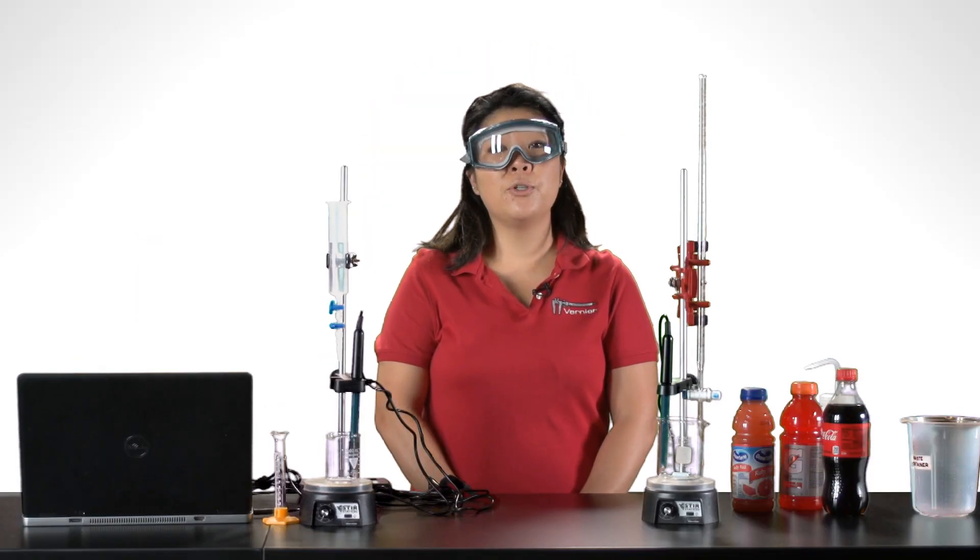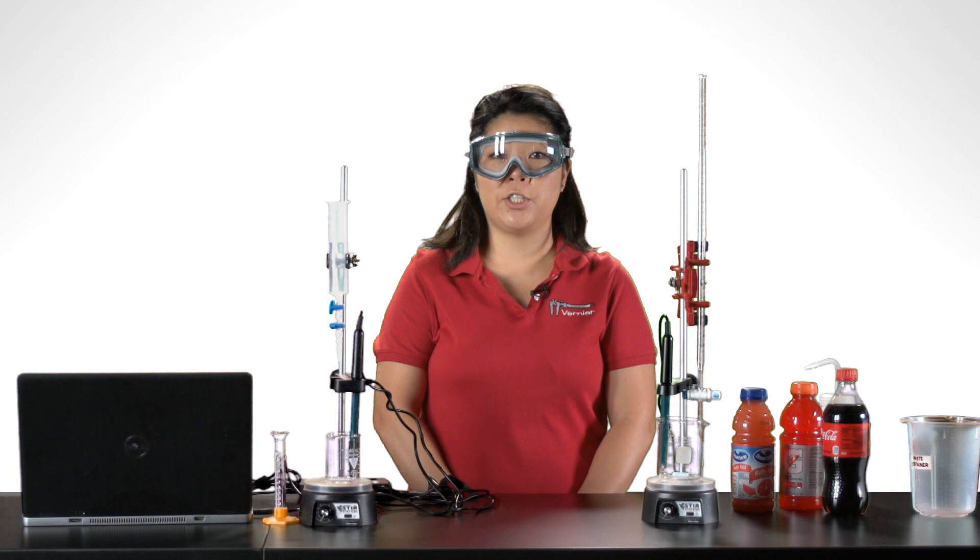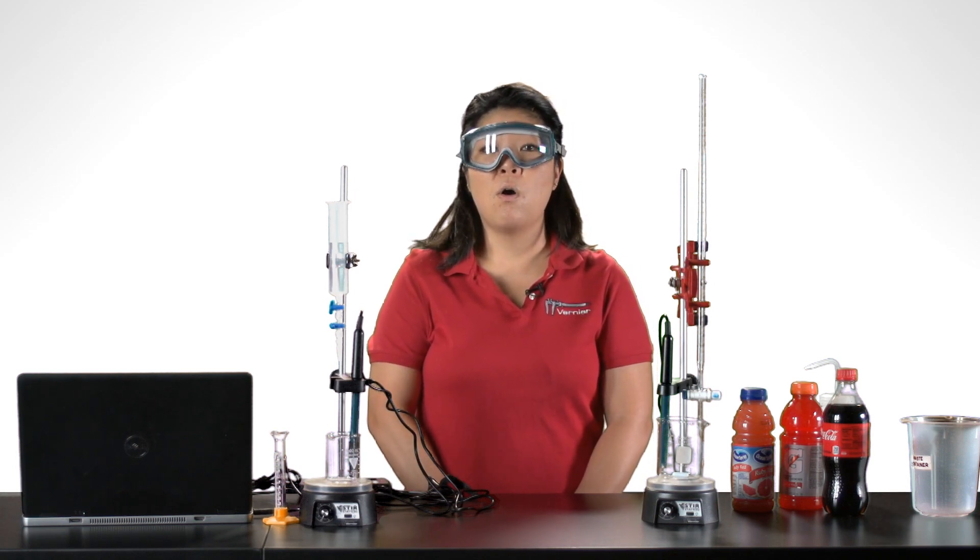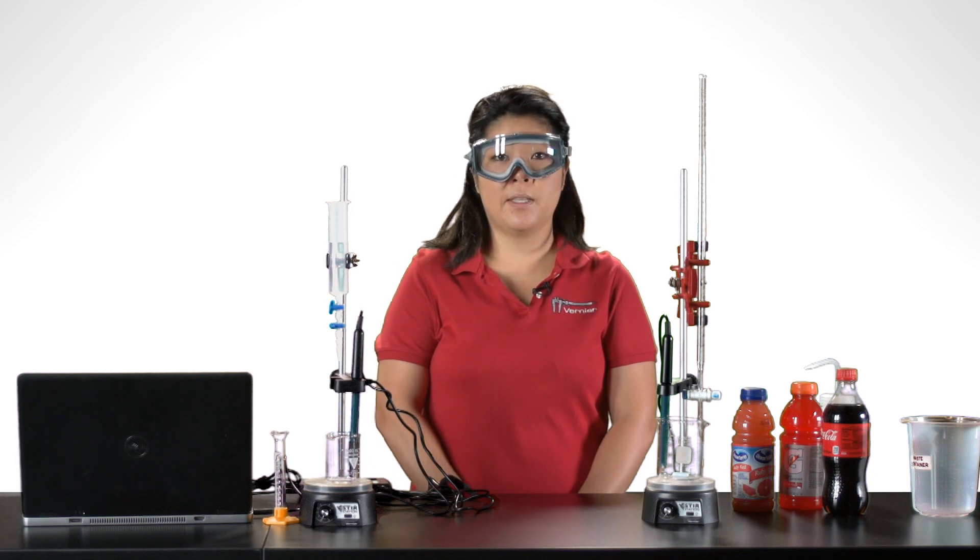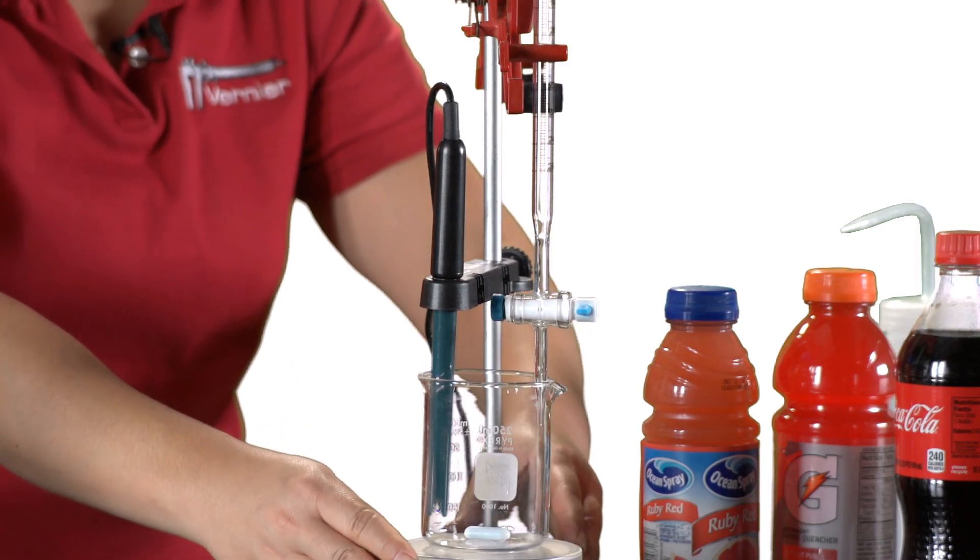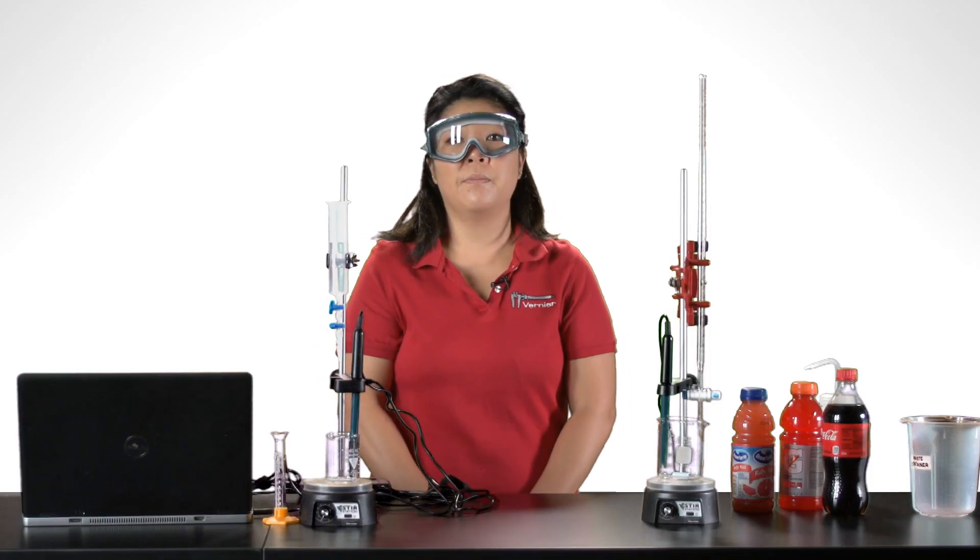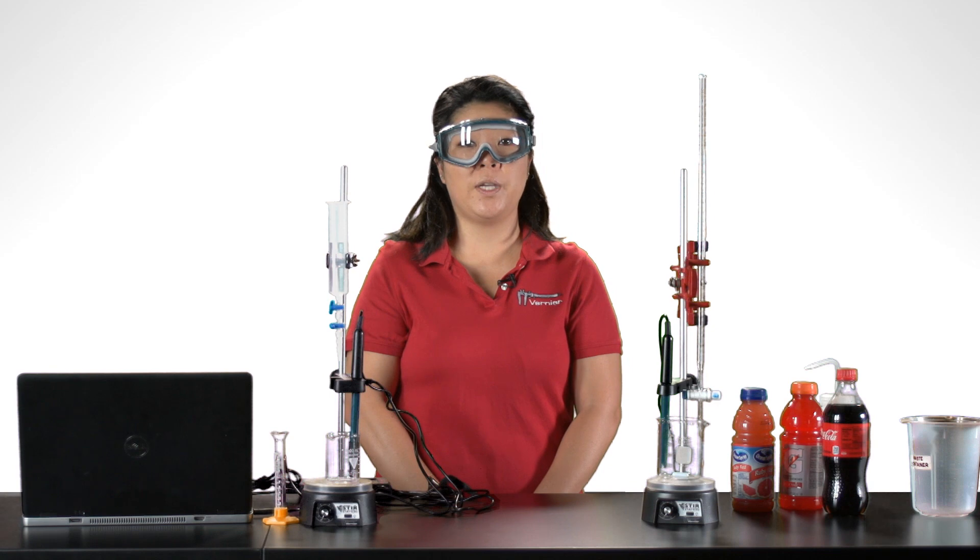For the equipment, here are two options for setting up the titration. Either option can be used with the computer running Logger Pro software or with LabQuest. This setup here uses a burette and a pH sensor. The volume will be manually entered for each pH reading.